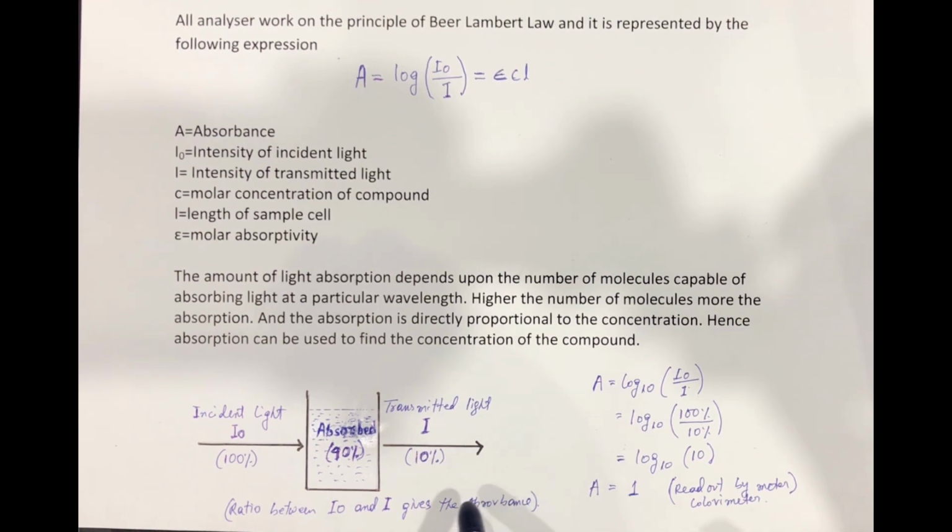This absorbance can be expressed as absorbance equals log to the base 10 of I0 upon I. If we replace I0 and I with 100% and 10%, we get log to the base 10 of 100% by 10%. And if we work it out, we will get log to the base 10 of 10. And you know the value of log to the base 10 of 10 is 1. Hence, absorbance is equal to 1.